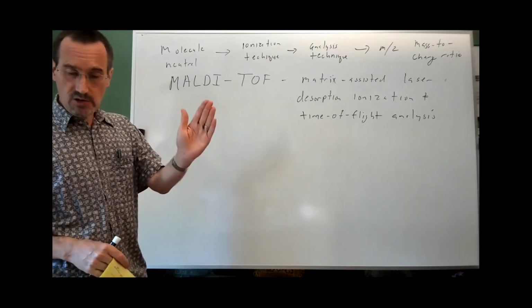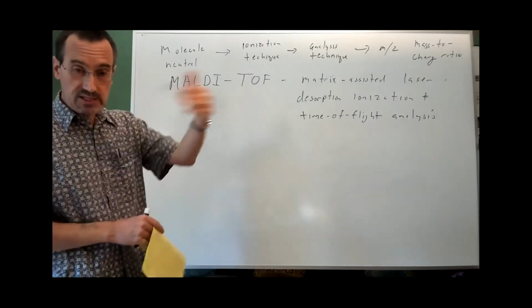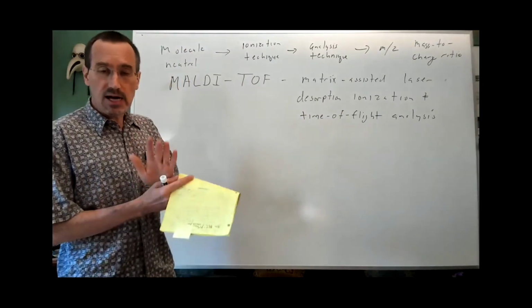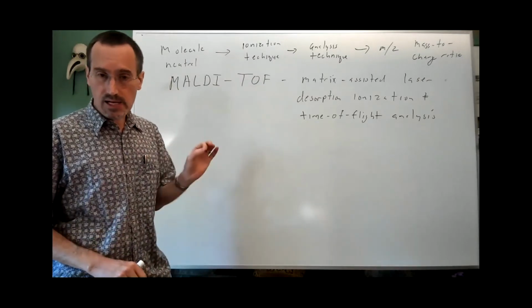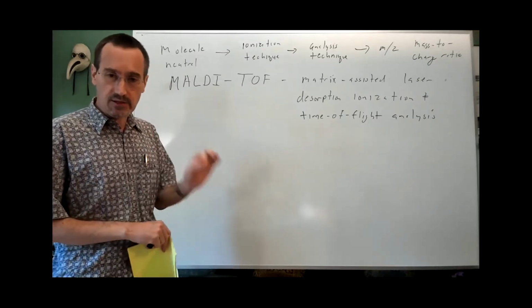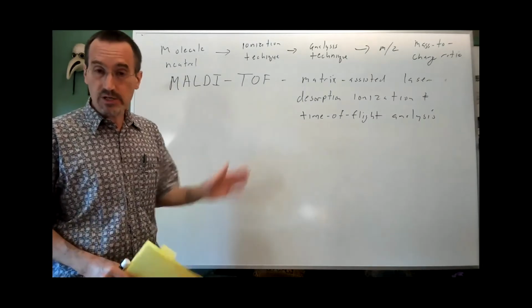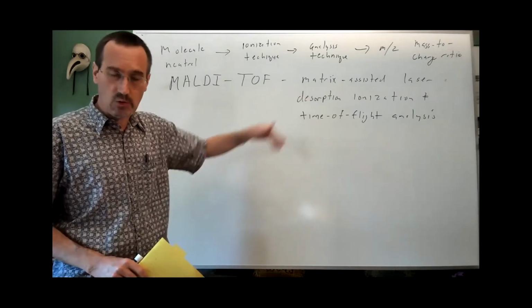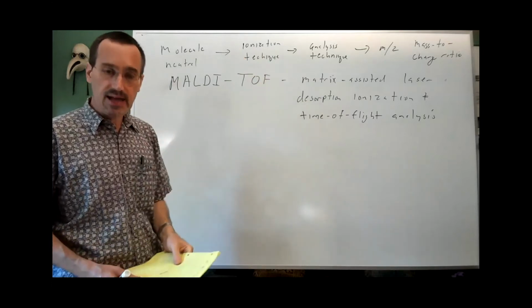Then the molecules are accelerated across charged plates, fly through essentially a tube, maybe back and forth with a deflector, come to a detector, and since the molecules are ions, you literally measure a current. You are detecting the electricity of those ions striking the plate, which generate a small electric signal. So basically now you'll get a time course of different ions coming in at different times, depending on how massive they are.